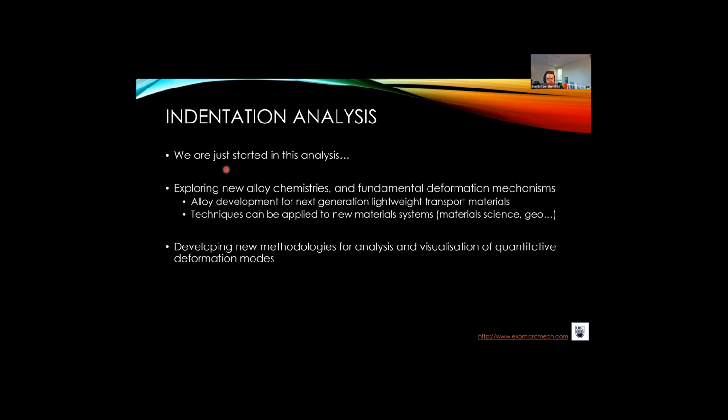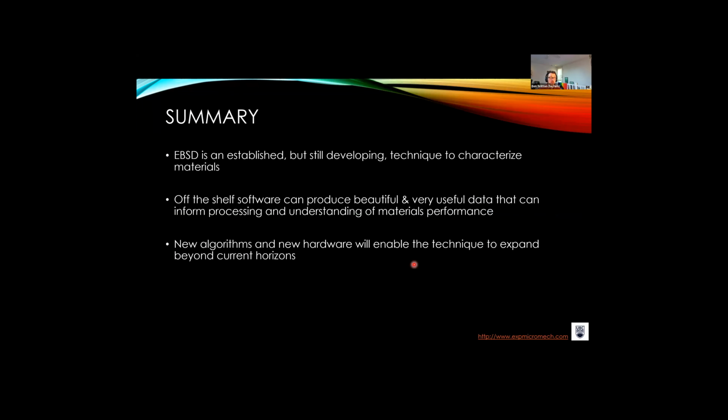To do this, we need new methodologies for the analysis and visualization to get quantitative data from these beautiful three-dimensional micrographs. So with that, I've hopefully persuaded you that EBSD is both an established technique that is immensely powerful. It's kind of scary to think that 30 years ago was the emergence of this new technique, and yes, I've shown you some brand new developments that continue to exist in this.